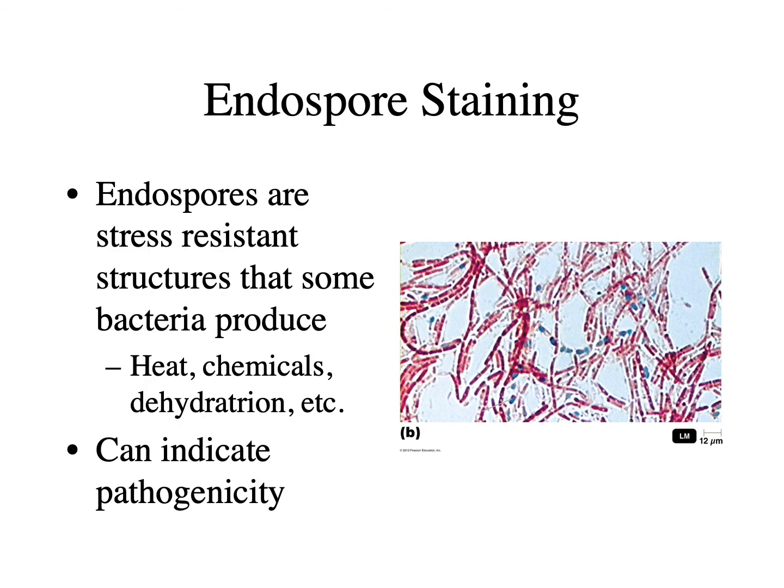Endospore staining can come in a lot of different ways, but I think heat is probably the fastest way to get bacteria to stress out, basically. This is really typical for soil bacteria to endosporulate when the soil dries or maybe it doesn't have the right environment. They basically have the ability to compartmentalize all of the important little parts of their cell into this little survival pod.